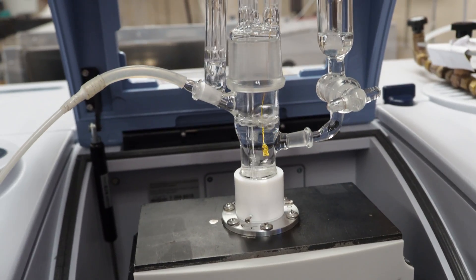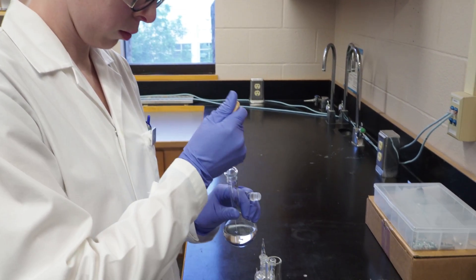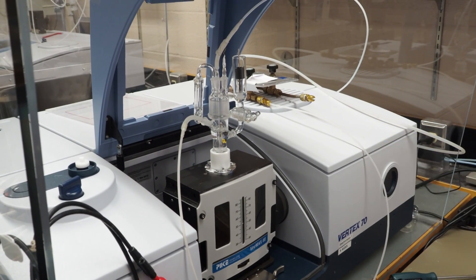This liquid is what we call an electrolyte. That means it has some dissolved salt, usually to make the solution more conductive, as well as something called an analyte, which is a molecule that we're interested in. That analyte could be frankly just about anything, as long as it does something interesting on gold.